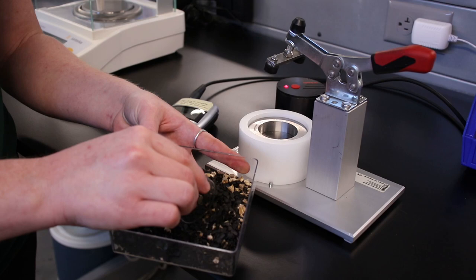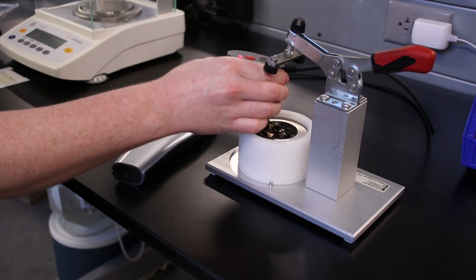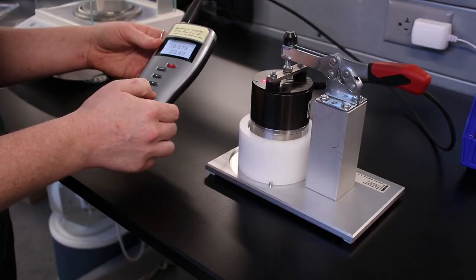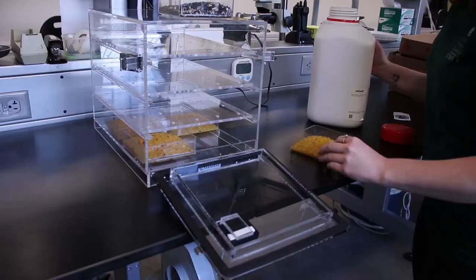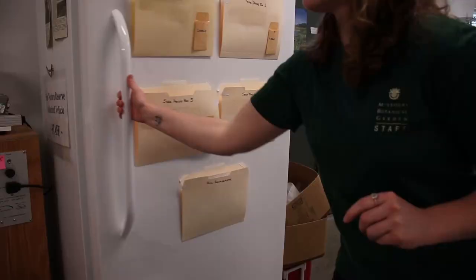We measure their water activity, or AW, before and after drying. A sample cup is filled and placed in a water activity meter. Freezing seeds that contain too much water can kill them. We dry the seeds in desiccation boxes containing silica gel. The boxes then go into the refrigerator to dry, which usually takes about two weeks.